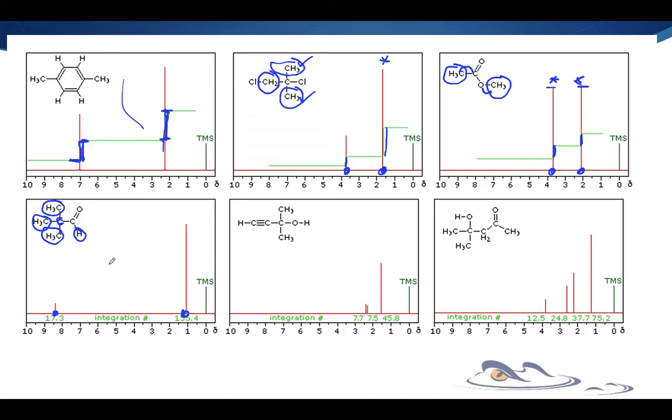So if I take this number here, it looks like about 155, right? And then I divide it by that 17 over there. I don't know. Do you think I'm going to get about 9? I think so. I don't know the exact number, but 10 times 17 would be 170. So this is looking like it's about 9 to 1. Yeah? About 9 to 1. And so that's how I can use those integration numbers here to come up with the ratio. See, 9 hydrogens to 1 in the environments. Let's try that again.